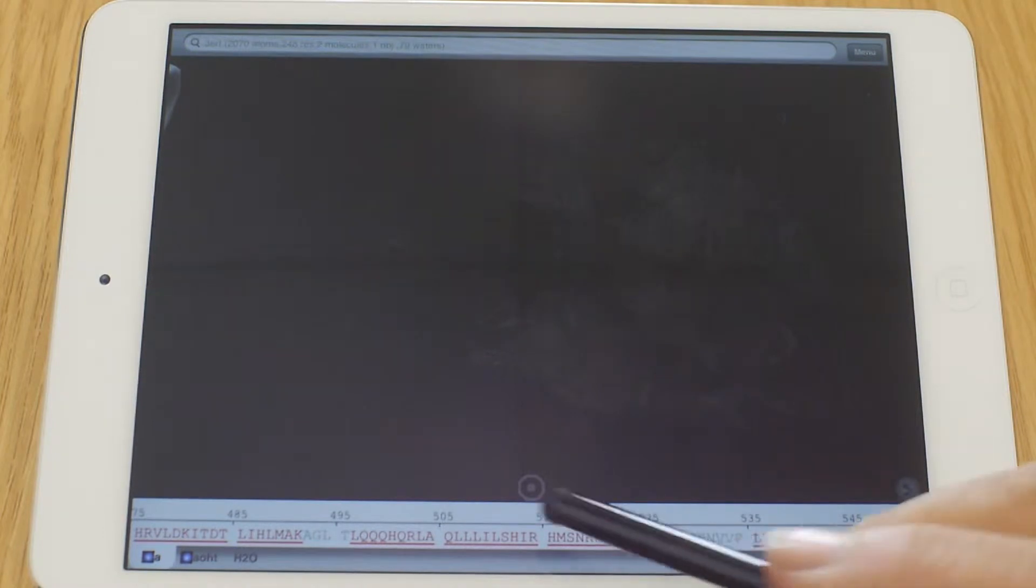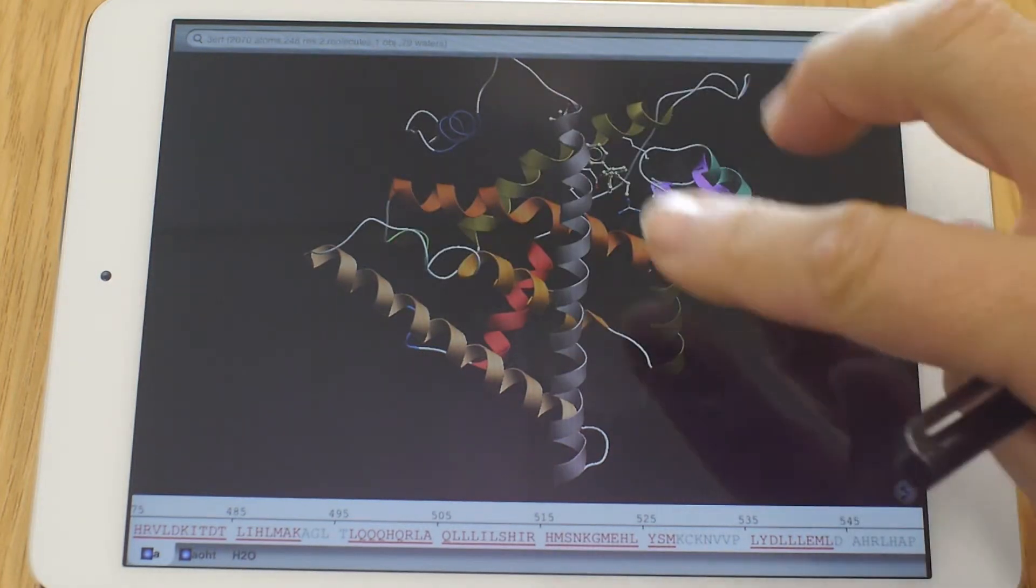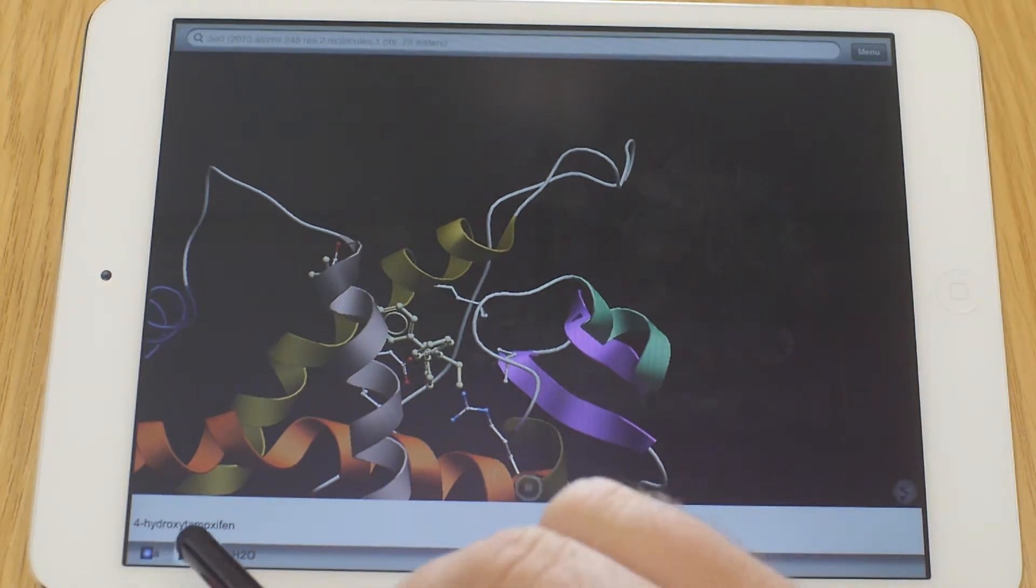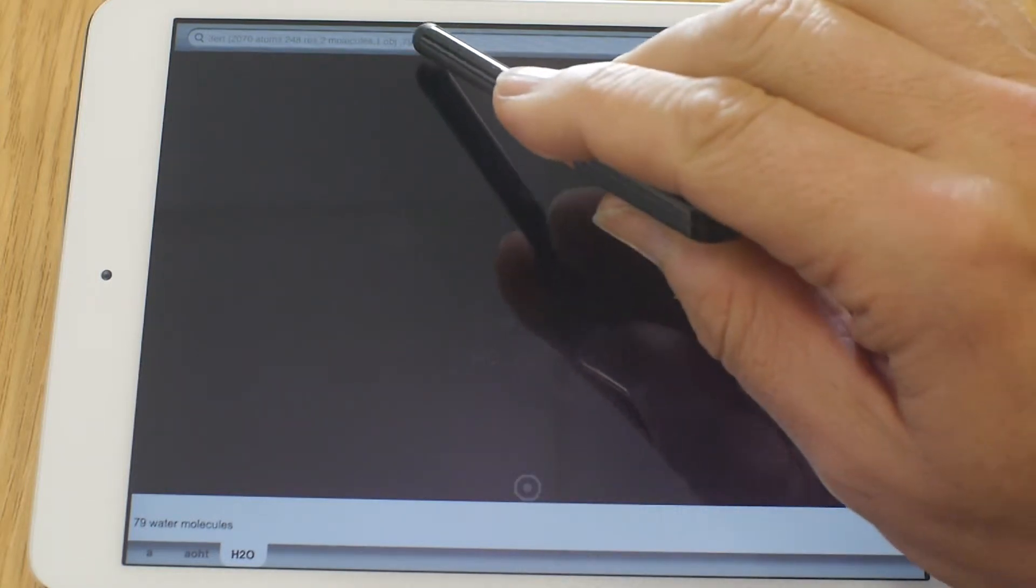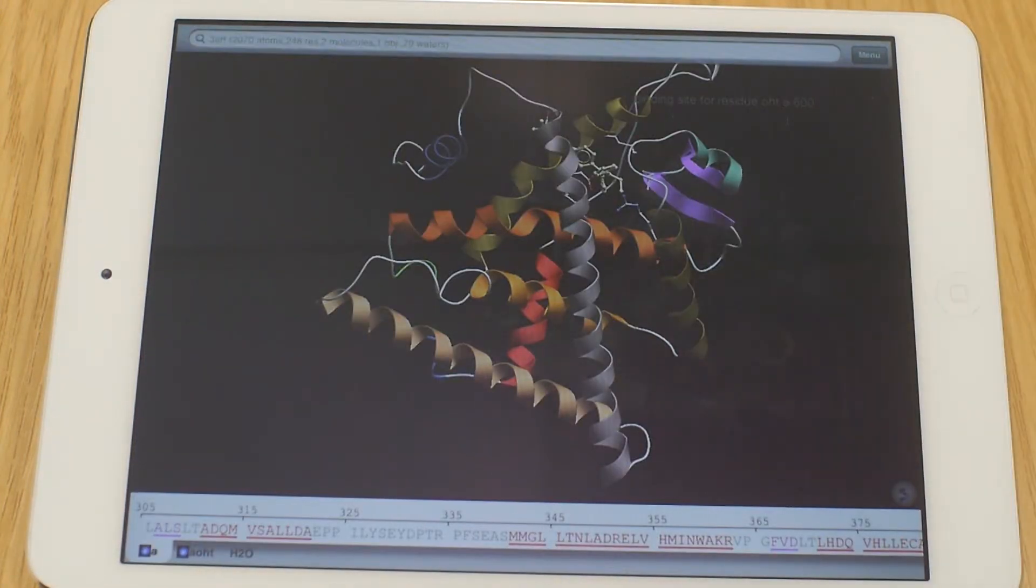Should you end up with a view that you don't know what it is, can't see your object, press this button here. And it centers your 3D file again in the middle. Let's open another file. And if you completely lost and you don't know what you've done, if you pressed on buttons that you don't know really what they are, and all of a sudden it all looks very weird or you don't see anything anymore, don't worry. Go here, click on it again. And there you are again with the default file. So if you're completely lost, just type in the sequence again.